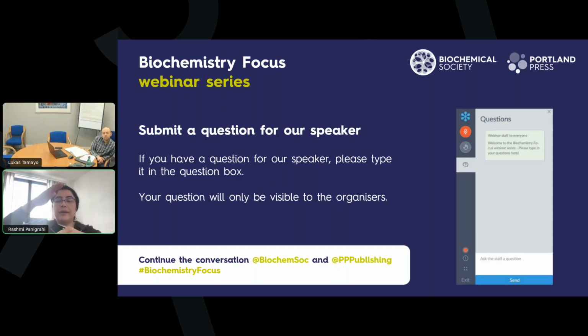Beautiful structures, but because of the tight packing, they don't slide. There is just a little bit of change in orientation towards the positive side for the dyad axis, which is a change in shift, but there is no slide. They are tightly packed. So yeah, and if I may say, as of now, ours is the highest resolution in terms of cryo-EM structures. But I'm sure in a couple of months there will be more structures with much better resolution. One more question, maybe we have time for it.